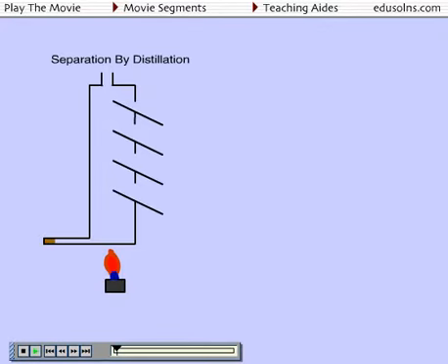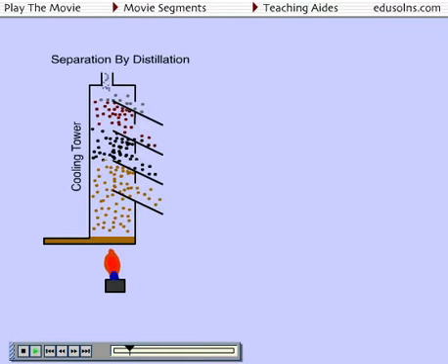To understand the naming of this parameter, we must go back to its origin in the petroleum industry. In petroleum refineries, the complex mixture of crude oil is separated by distillation. The mixture is heated up, compounds travel up the cooling tower, and groups of compounds separate based on their boiling points. The compounds with the lowest volatility, or high boiling point, condense first and are collected on the lower plates of the cooling column. The more volatile compounds rise higher in the column, finally cool, and are collected by the higher plates. The concept of the plate was developed in order to judge the quality of the cooling column and the point at which a given class of compounds is collected.